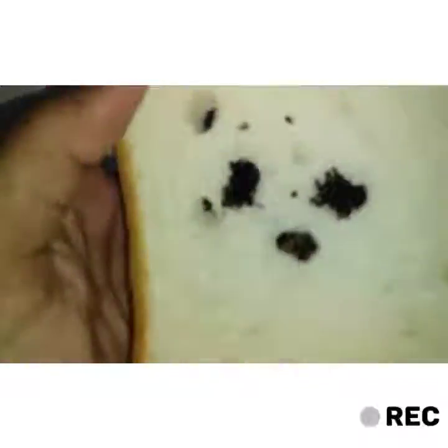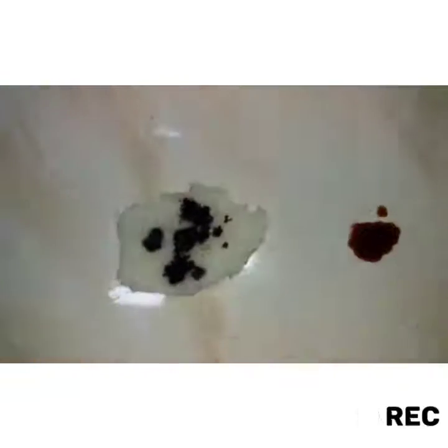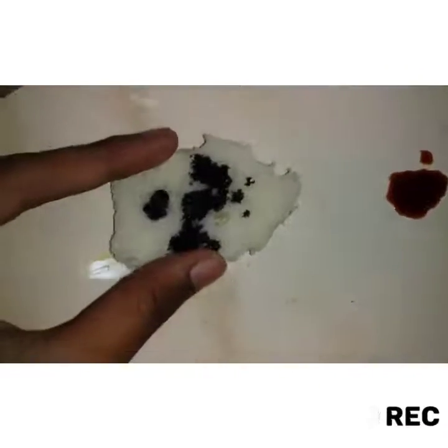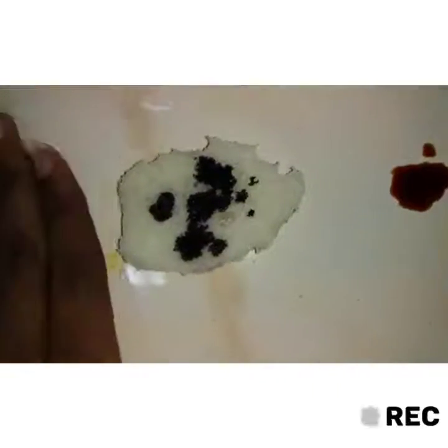You can see the color difference — purplish blue and the yellowish brown. Observe that the yellowish brown color of iodine changed to purplish blue in starch-containing food, which is the slice of bread.